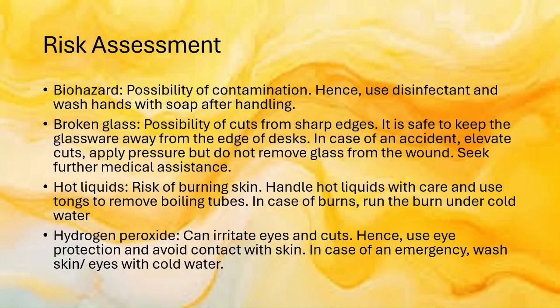There is the risk of broken glass, possibility of cuts from sharp edges. So it is safe to keep the glassware away from the edge of desks. In case of an accident, elevate the cuts, apply pressure, but do not remove glass from the wound and seek further medical assistance.